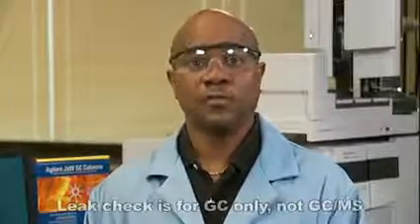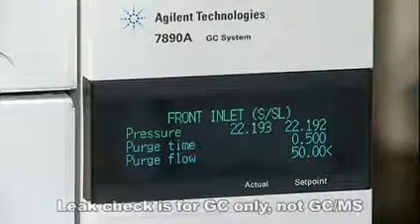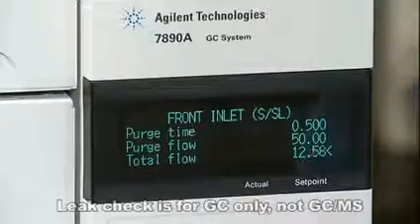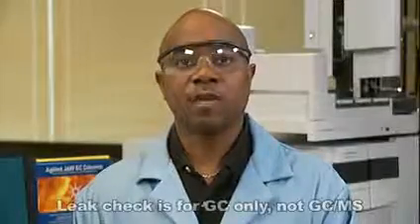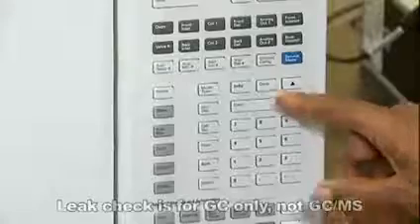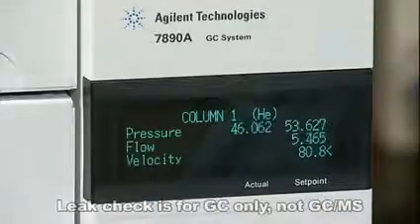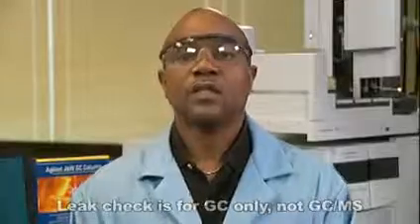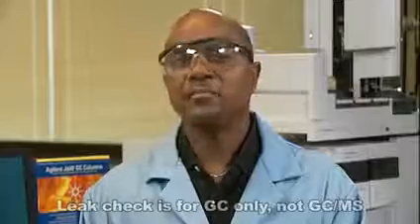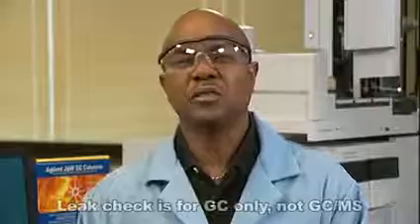Set the purge flow to 50 mils a minute. Next, set your column flow to 7 mils a minute. Set the septum purge flow to 3 mils a minute, then allow the inlet pressure to stabilize. The total flow should be approximately 60 mils a minute.